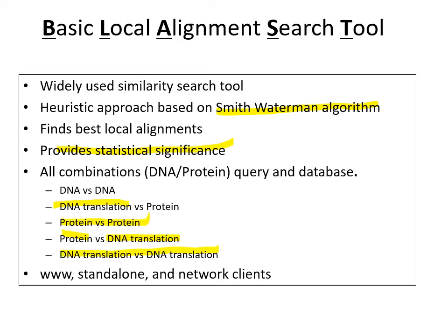So all of these different ways of interacting, depending on what kind of starting material you have, you can come out with a lot of different information. And they're always adding tools to this. So there may even be more tools than that now. But again, what we're concerned with today is DNA versus DNA. Very straightforward.